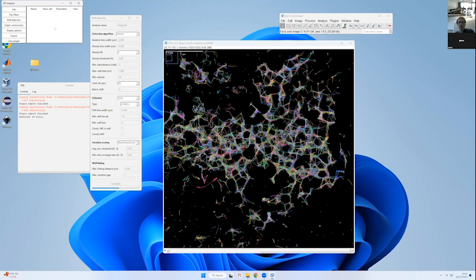Basically, it runs the algorithm, finds the regions of high density automatically, and at the end, the algorithm will give you a collection of circles where the potential wells are, and it will give you all the statistics. We'll see it as it comes.